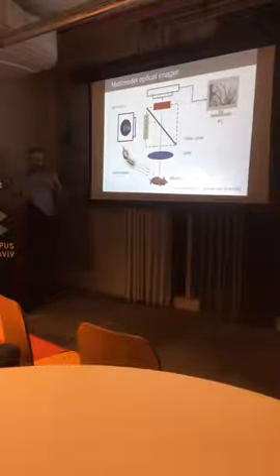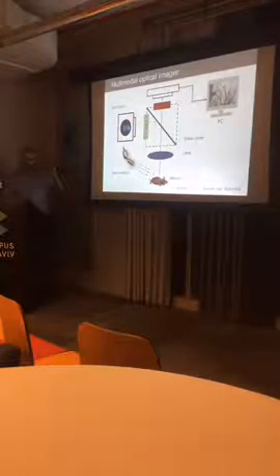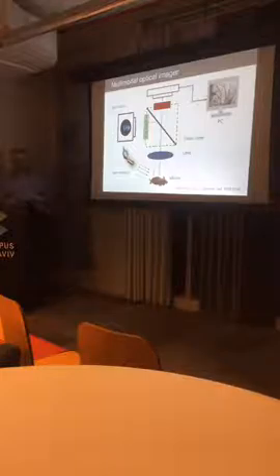I'm not sure I understand. Why do you have both a light source and the laser, both of them lighting the same spot? Because it's 2 modalities. We use 2 modalities for different purposes, and I will show why we do.